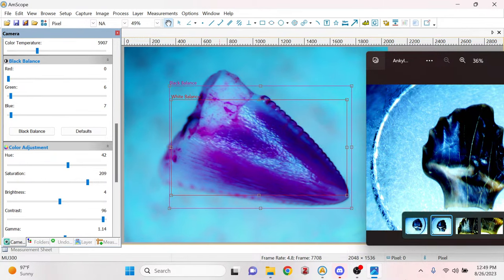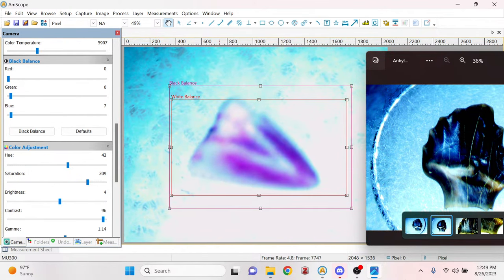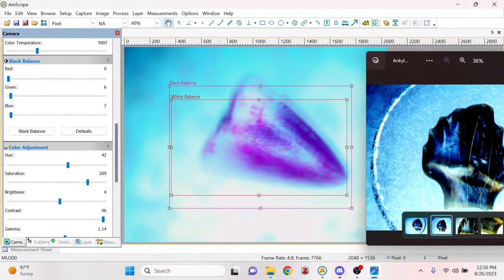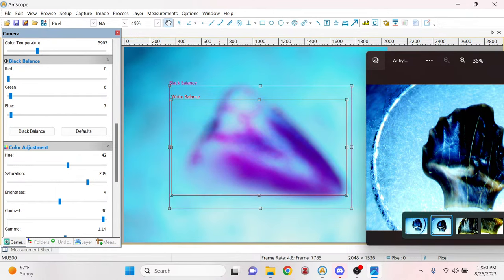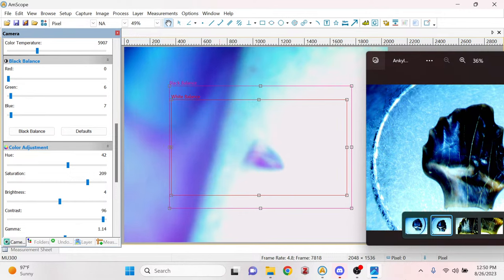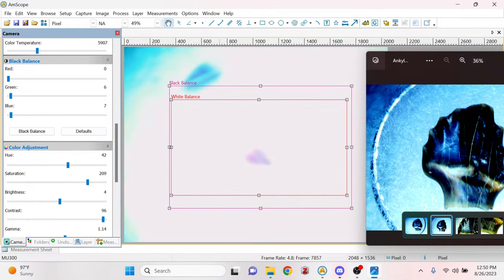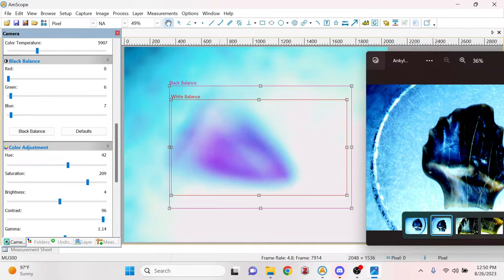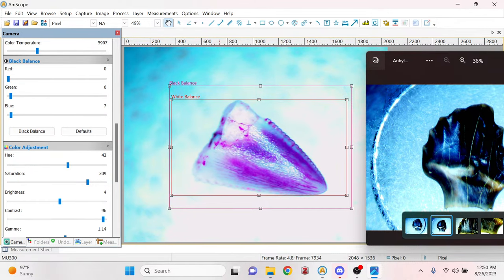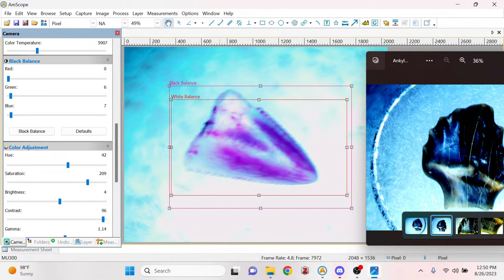See what this guy looks like close up. So these are all fossils that have been picked out of sediment, collected in these formations. You don't just go walking around in the desert and randomly find something that... Let me get my finger for scale, if at all possible. Can't even really see it. Something that is much smaller than my fingernail. You don't just walk out into the desert and find that. You have to collect dirt first and then wash it, basically, to separate out things into different particle sizes, and then go by each batch under a microscope.